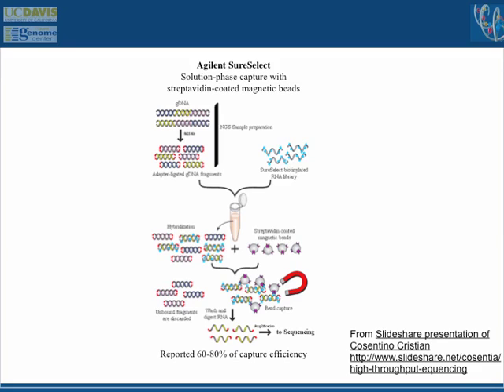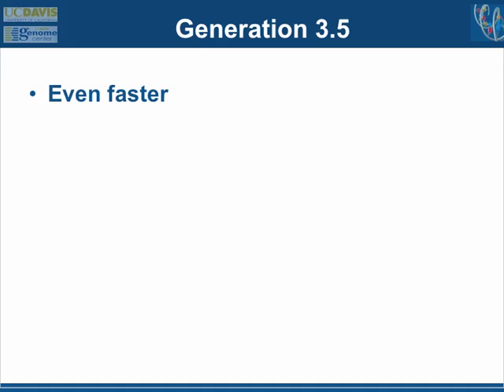And the sequencing is getting cheaper at a rate faster than Moore's law. So I would expect in a year that you can, in essence, consider sequencing to be the cheapest part of your project. It's the dealing with samples and dealing with the bioinformatics that's going to be the challenging part. Obviously, if you're doing large genomes of organisms and you need hundreds of those, sequencing is still going to be an expensive part. But if you need 10,000 base pairs from 10,000 organisms, that's one HiSeq run. Not even. You get more than that.